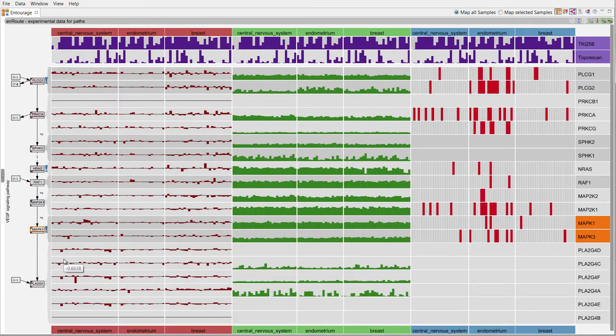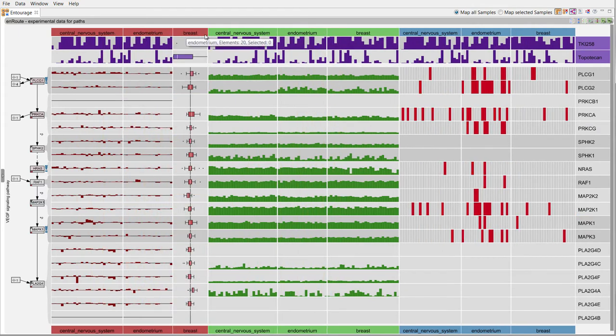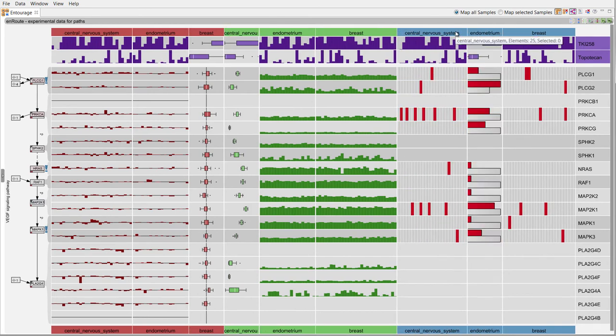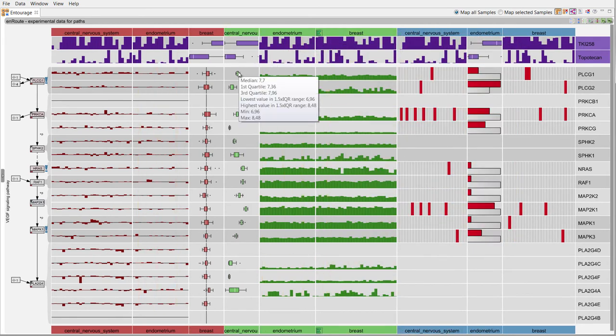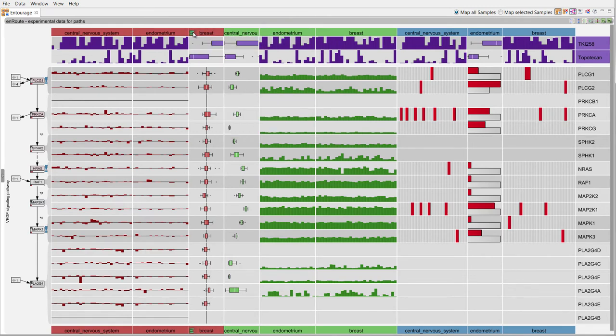As an alternative to individual bars, we can also show summary representations. We use boxplots for numerical data and histograms for categorical data. Hovering the mouse over a boxplot reveals details about the distribution.